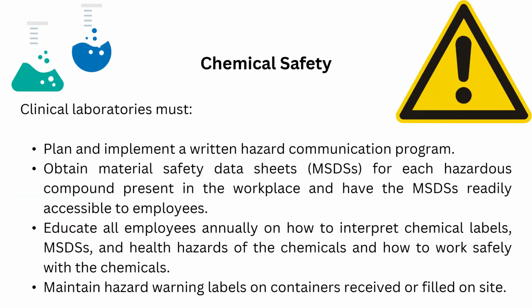For chemical safety, the clinical laboratories must plan and implement a written hazard communication program. Obtain a safety data sheet or MSDS, the material safety data sheets for each hazardous compound present in the workplace, and have the MSDS readily accessible to employees.